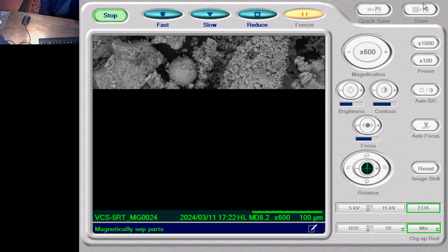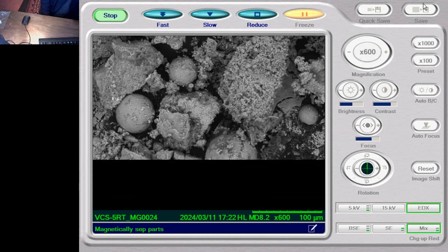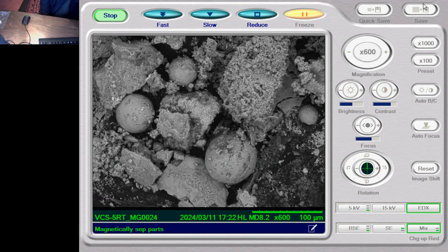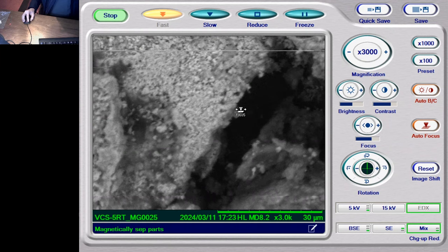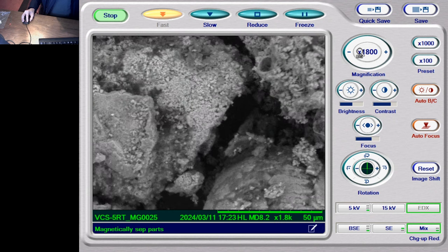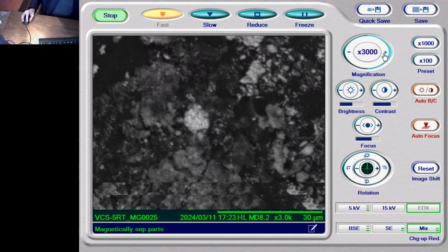So possibly the agglomerations that you see might be cavitation that didn't really do much. It just captured a bit of iron or produced a bit of iron, and it forms this agglomeration. Is this an agglomeration occurring here? Like, for instance, that.